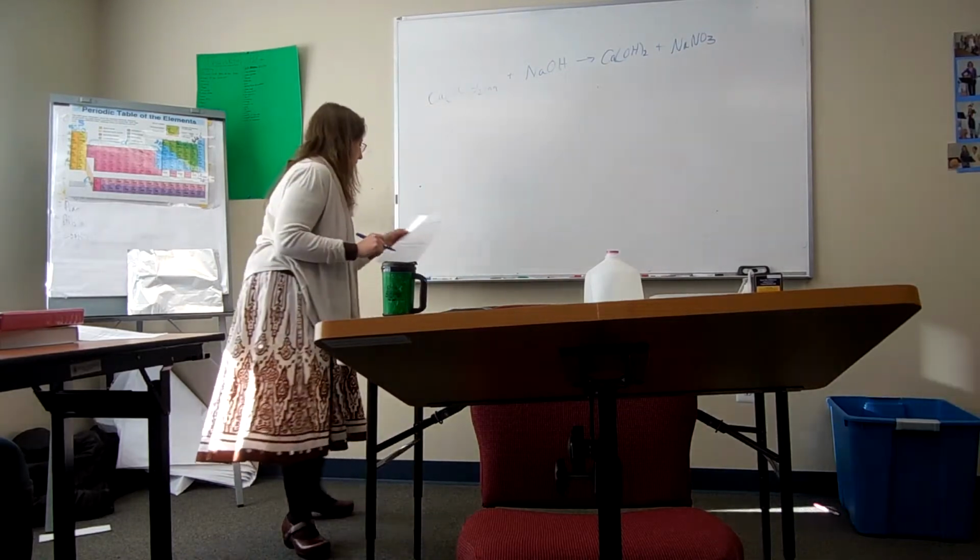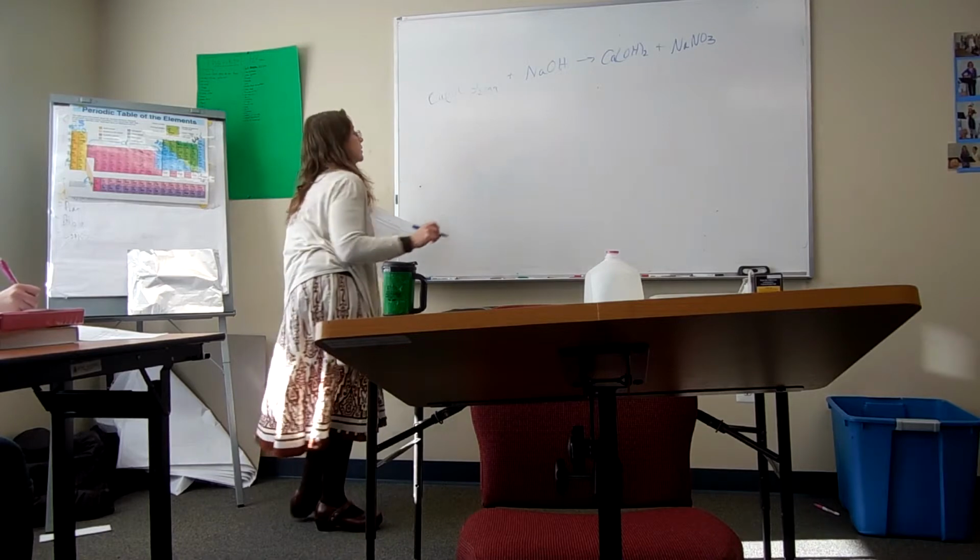I'll start cutting these up, and then we'll test them out and see if our predictions are good.